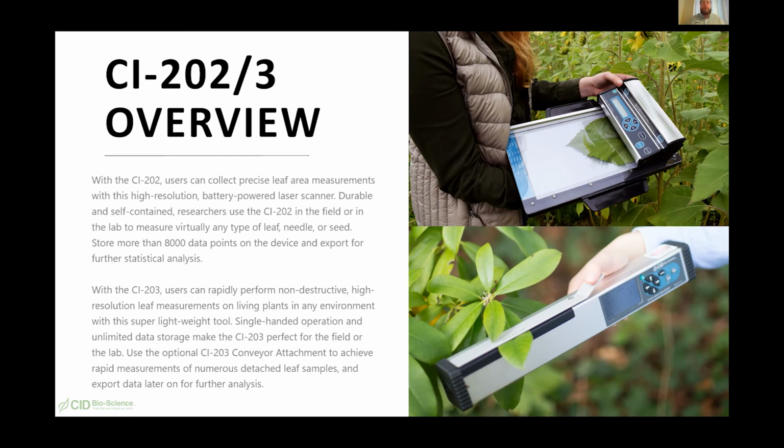If you know the number of seeds you want to put on the palette, then I would recommend actually putting that number of seeds on the palette, scanning it, getting that total area and length and width and volume, then dividing it by the number of seeds. But it won't be able to actually count seeds for you.